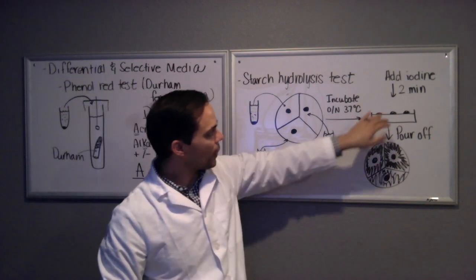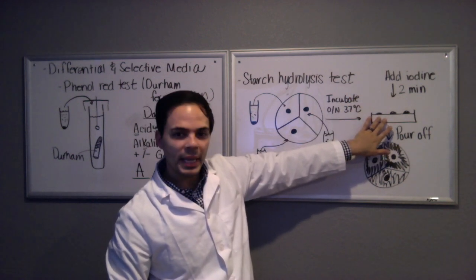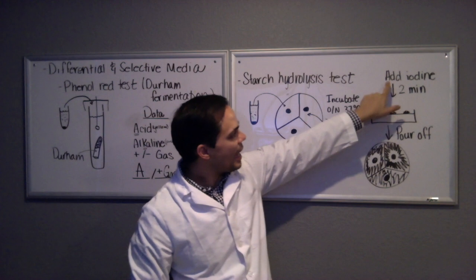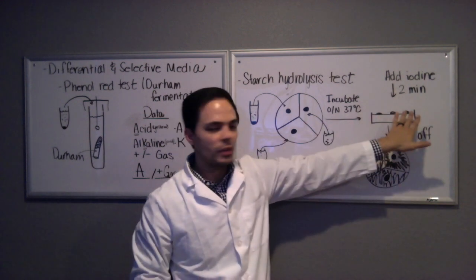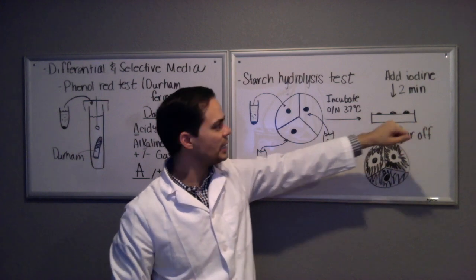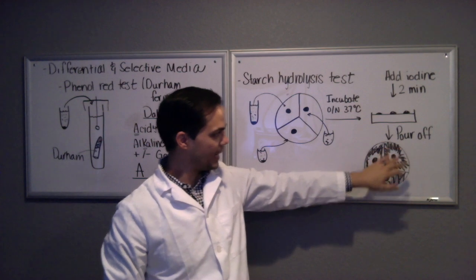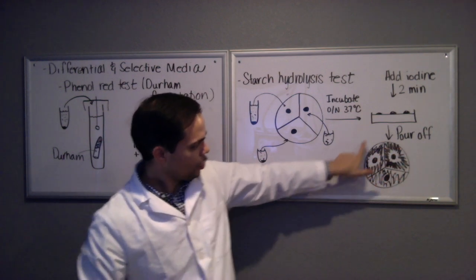Once you have good growth, you want to come back and open the plate and add iodine. So you flood the surface with iodine where you'll have bacteria growing, flood the whole thing with iodine, wait two minutes, pour off the iodine in the appropriate waste container, and then you want to observe the plate.